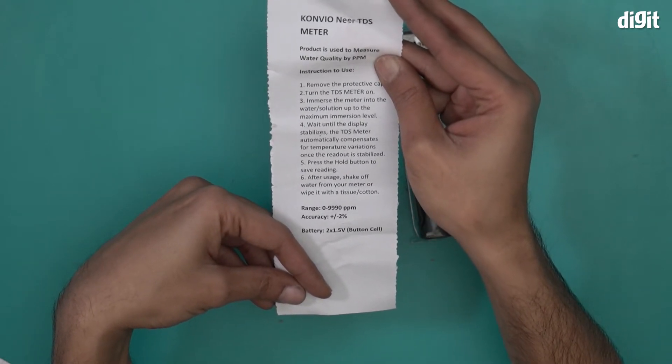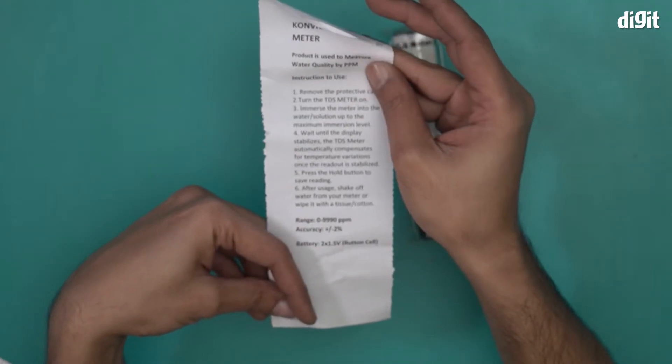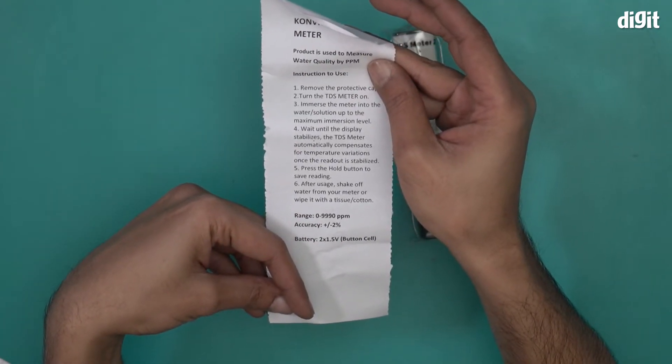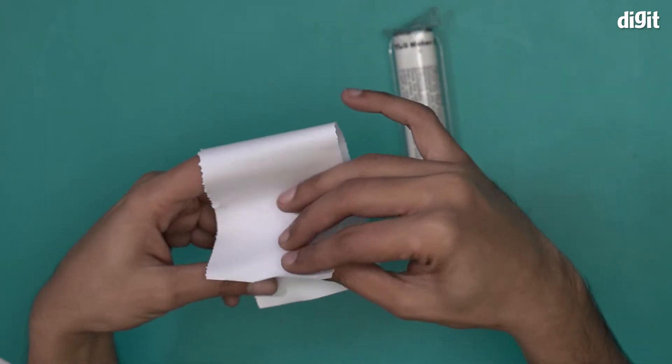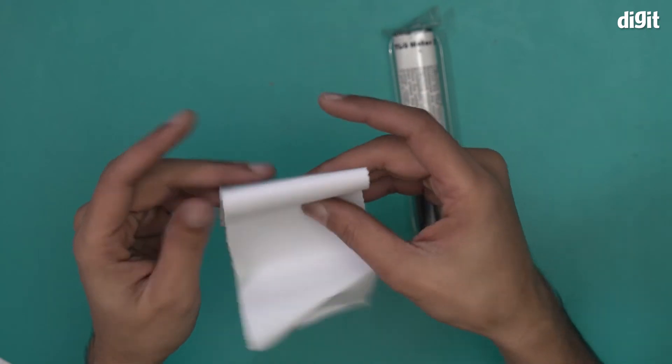After usage, shake off water from the meter or wipe it with a tissue cotton. So yeah, that's it. Range is 0 to 9990 ppm. That's pretty good. It's a great range and it runs on two 1.5 volt button batteries.